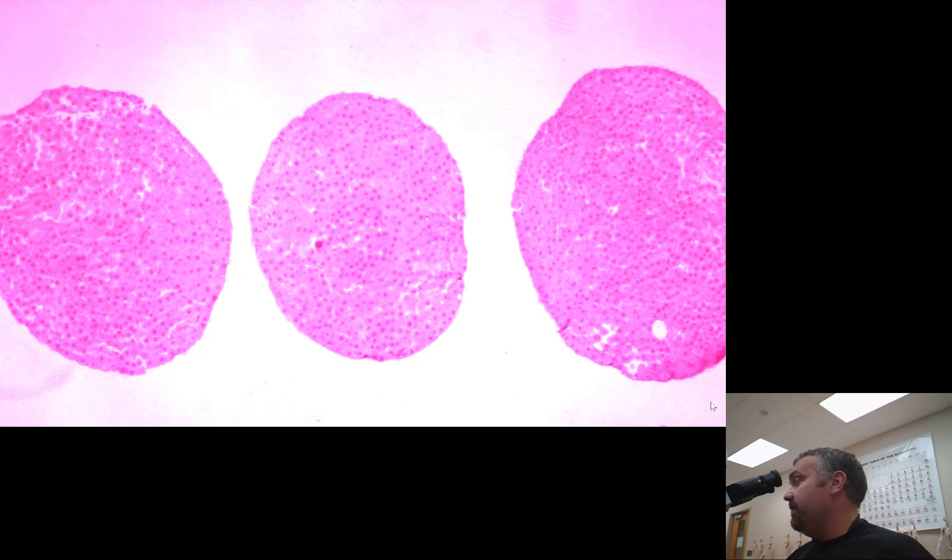I like that you can get a lot of double duty out of this. You can use this just to learn how to use the microscope and play around and see cool things, but you can actually see the process of nuclear division and cell division occurring in this slide as well.